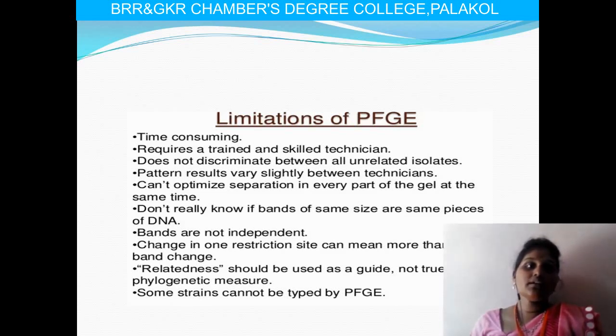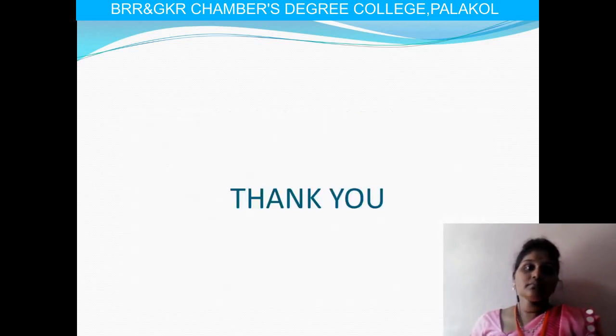It also does not discriminate between all unrelated isolates, and cannot optimize separation in every part of the gel at the same time. It takes more time from one gel, and it is a time-consuming pattern. Thank you.